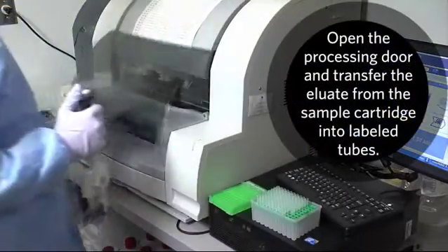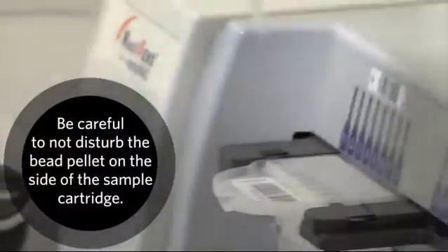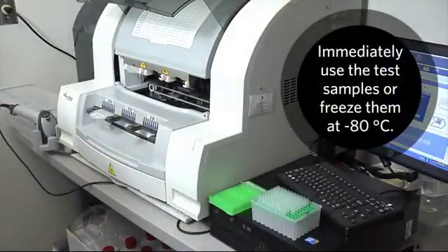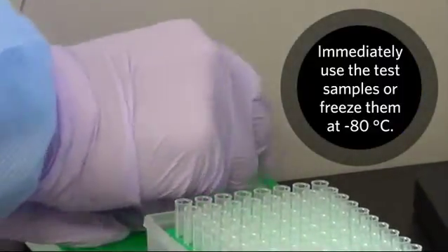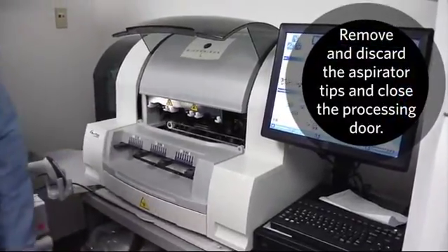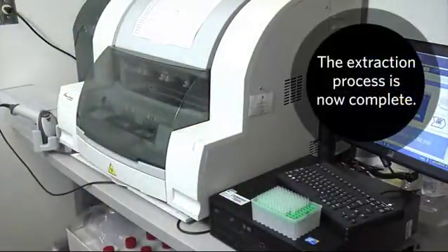Open the processing door and transfer the eluate from the sample cartridge into labeled tubes. Be careful not to disturb the bead pellet on the side of the sample cartridge. Immediately use the test samples or freeze them at minus 80 degrees centigrade for up to 30 days. Remove and discard the aspirator tips and close the processing door. The extraction process is now complete.